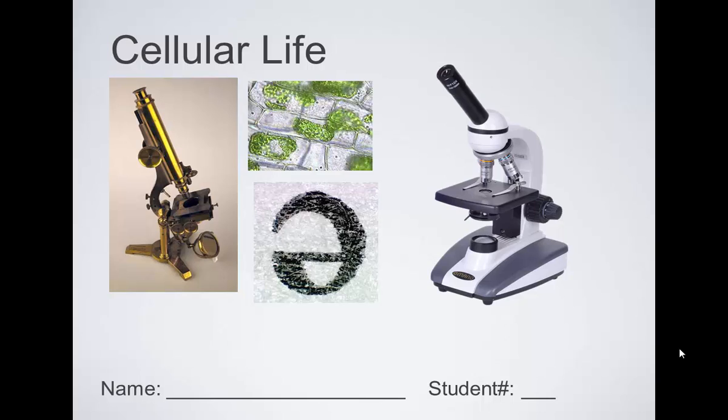In fact, scientists couldn't really explore or identify cells until the microscope was invented and made good enough to see cells. Because, like you guys told me in the beginning of class today, microscopes are used to see things that are often too small to see with your regular eyes. And so people didn't know about many of the types of small living creatures in pond water. They didn't know that blood is made up of small little red discs that we call blood cells. So it wasn't until scientists had these microscopes that they could figure some of these things out.